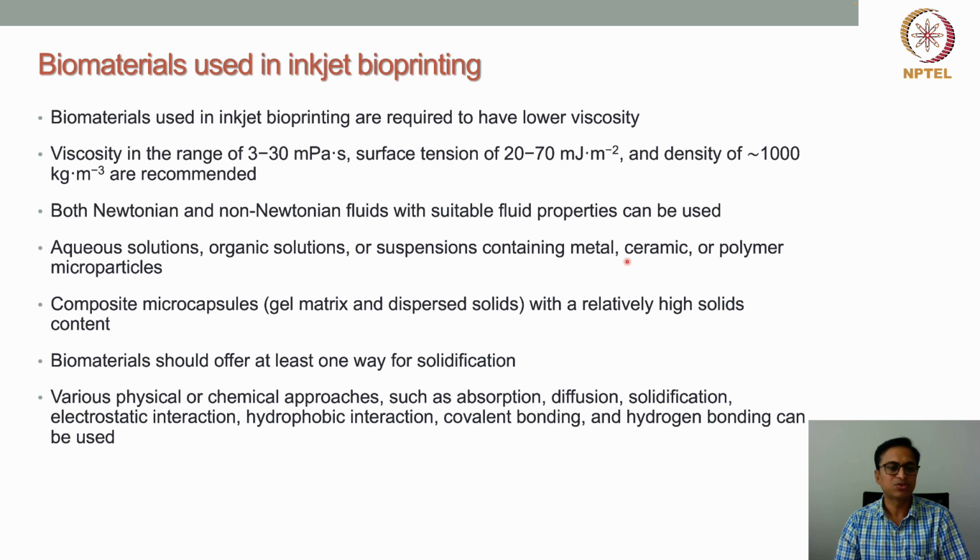So biomaterials should offer at least one way for solidification, so that after printing the structure is stable, and the structural fidelity, that means the way the structure is built, is maintained.